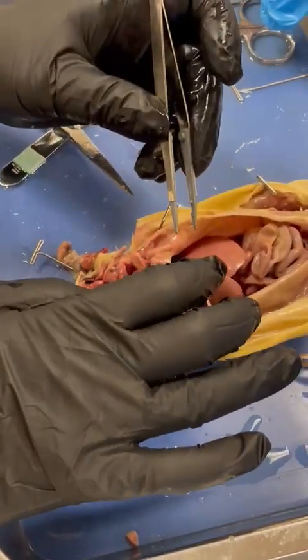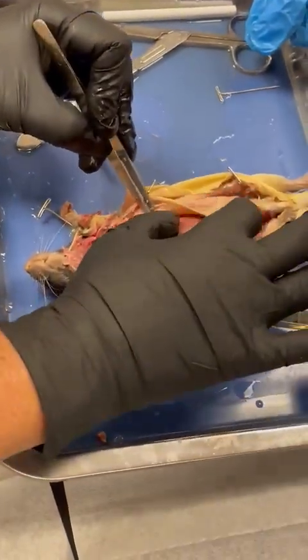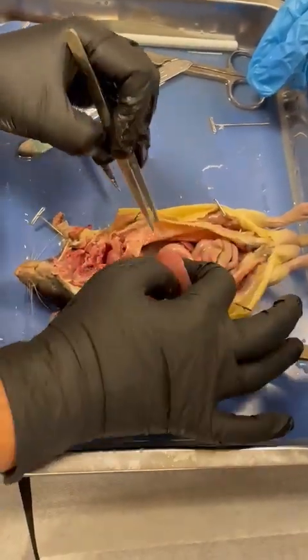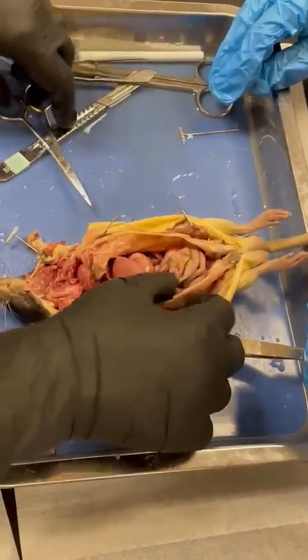Can you see that? Come this side. It goes through the diaphragm, and all of this is the liver. This is the stomach. So the esophagus joins the stomach, like that.